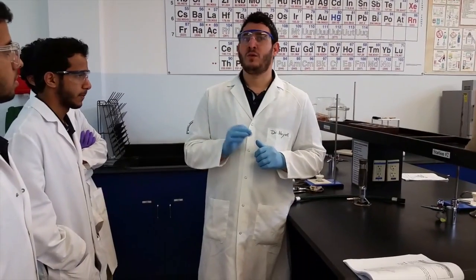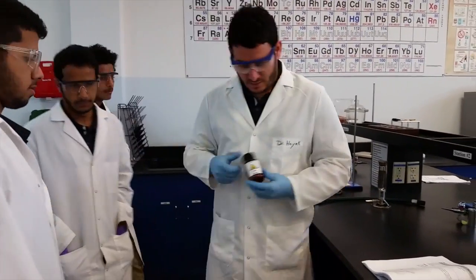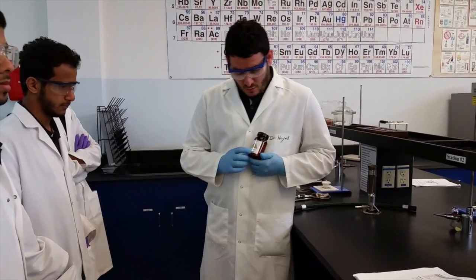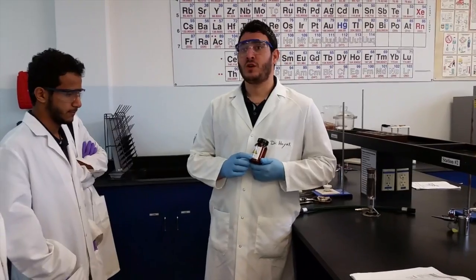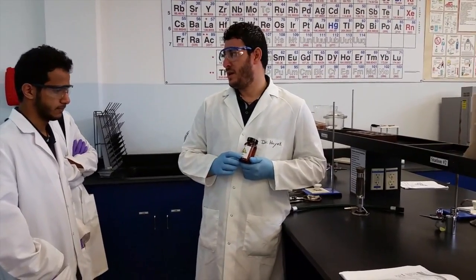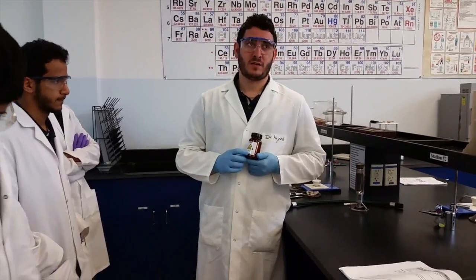Today we will be giving you a salt which is barium chloride with X H2O. You don't know how much X is - you need to determine this. The way we determine X will be explained later in the post-lab discussion, but there will be experimental data that you have to collect.